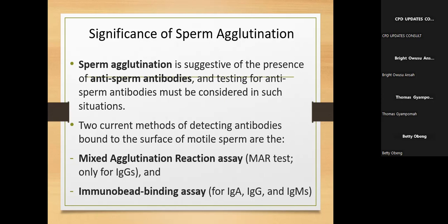Okay. So like we're talking about the round cells. If you do semen and round cells are higher, go ahead and do, let's say, your peroxidase test. That one, the patient will be charged because the peroxidase test is not part of the routine semen analysis. So you do your peroxidase test and it's also high, then it means that you confirm that it's infection. Go ahead and do your semen culture. And all those things is reflexing, and the patient will be charged accordingly.